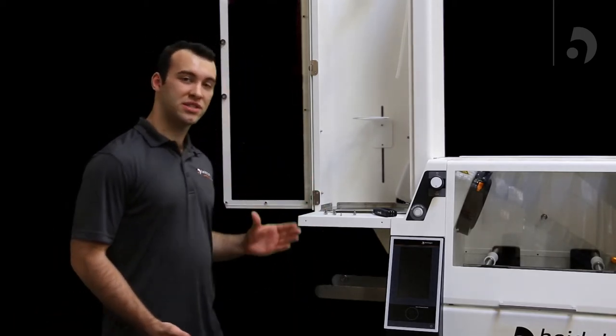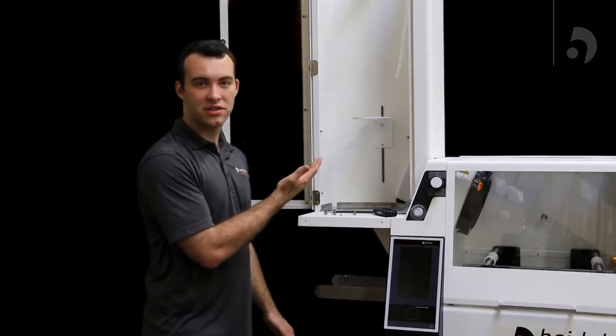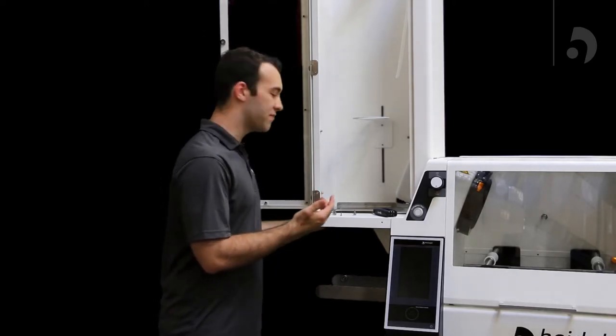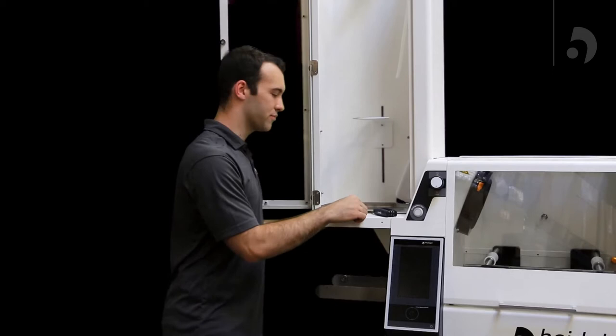The first step to assembling the HiVap Industrial is to pull the housing out of the box. After you do that, you're going to set it on top of your unit and line it up with the five holes that are both in the bottom of the housing and the side of the unit.